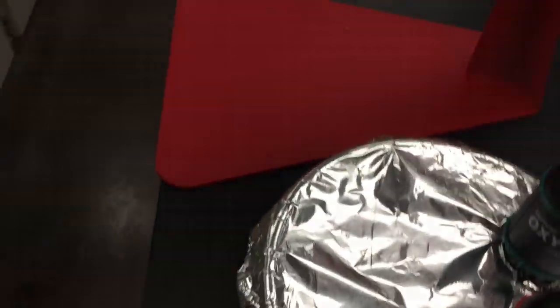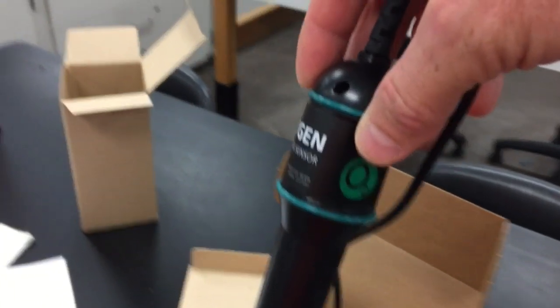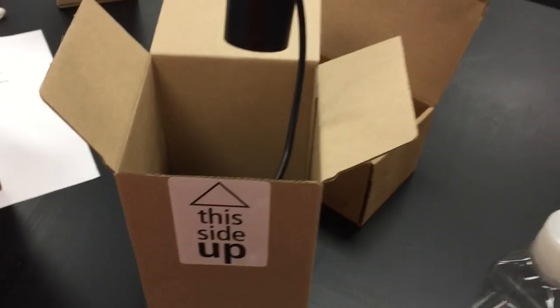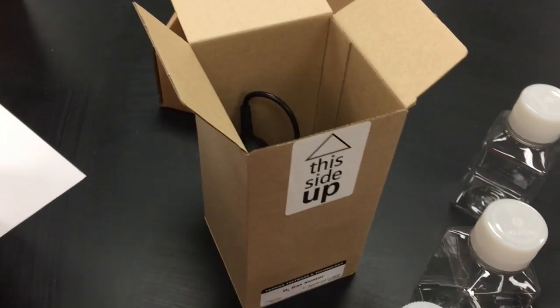When you return the oxygen sensors, make sure they go in their boxes upright — they apparently do need to be stored upright. Place them in the box upright and close the box. Don't just put them in randomly.